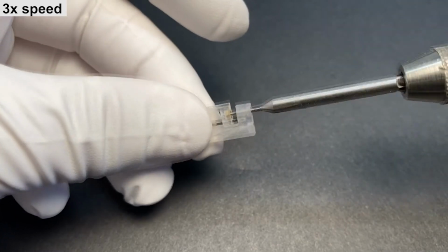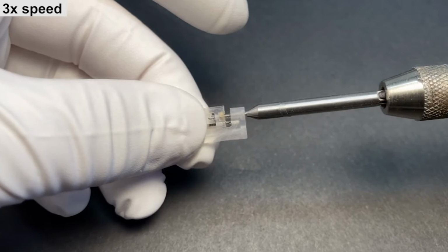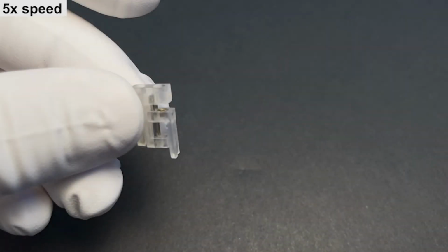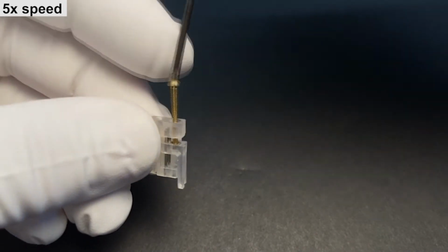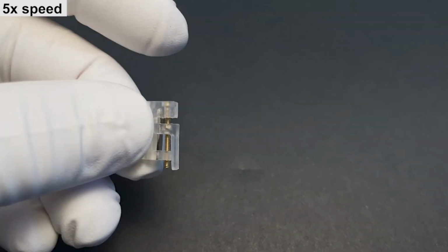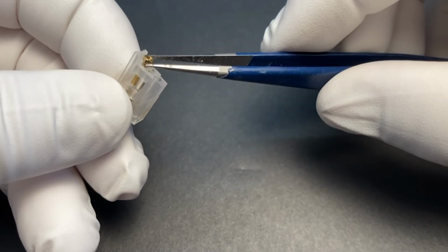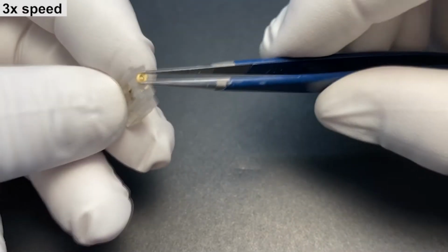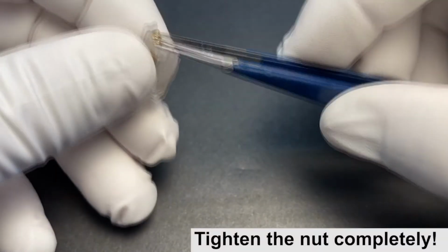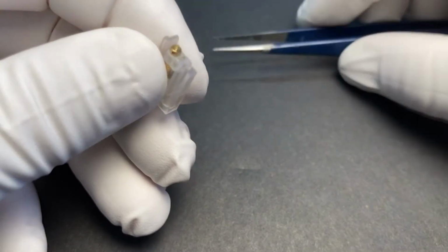And then once this is done, you could tap the plastic. This is just an extra security feature of the drive. If the metal nut is moving, then you still have some threading in the plastic, which can further support the movement. Then you can insert the front screw. And then we need to attach a nut to this screw. And once we attach that nut, we can solder it together, and basically that will create the movement of the arm if we solder these joints together.